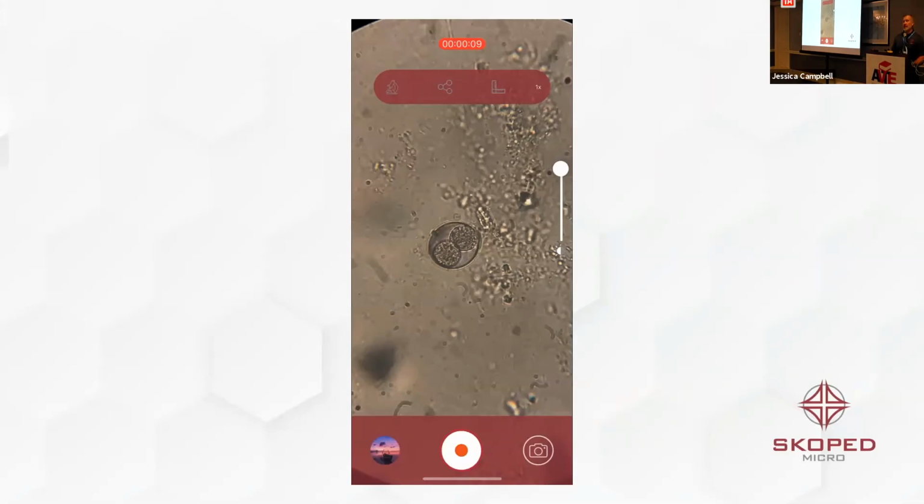We're also looking at different pilot programs. Again, we're just starting. We're open to anything, to tell you the truth. But we're looking at some pilot programs where if you buy a case for yourself, we'll give you one for your classroom so that your students aren't breaking yours.